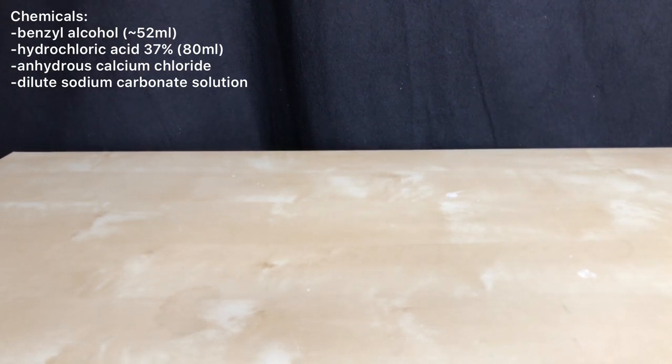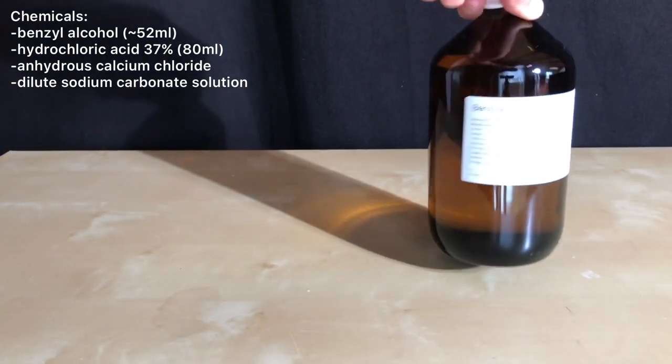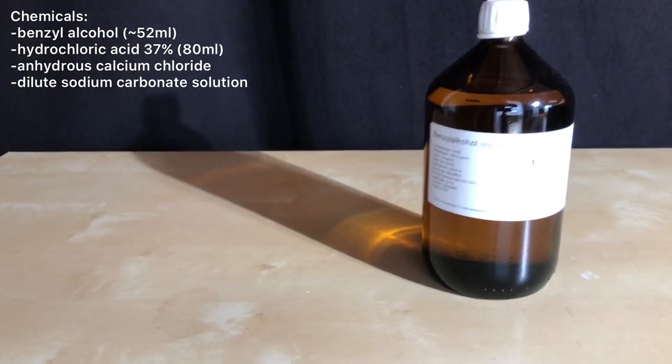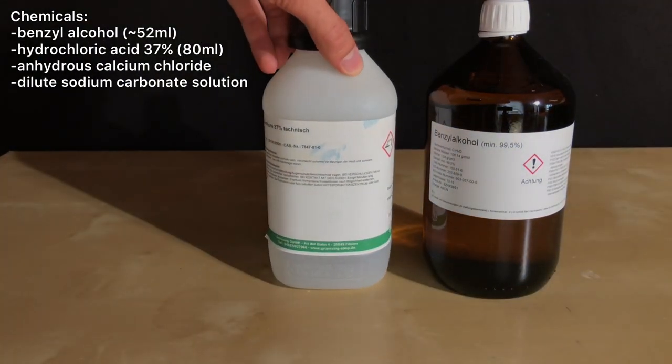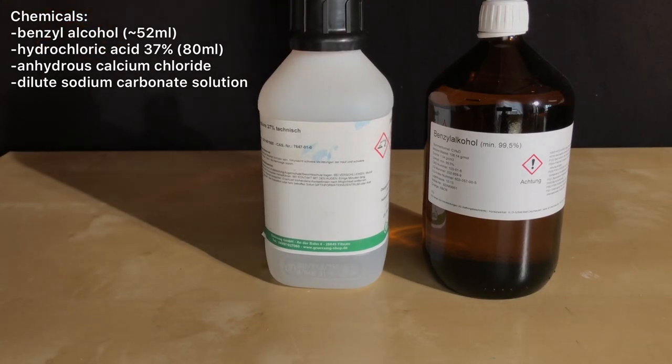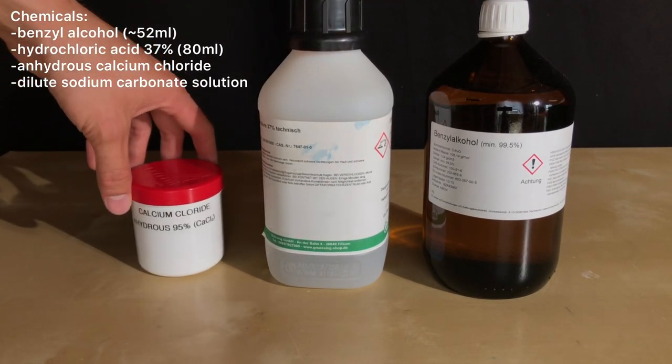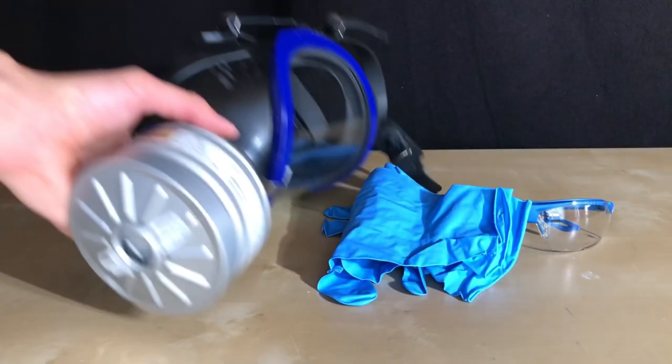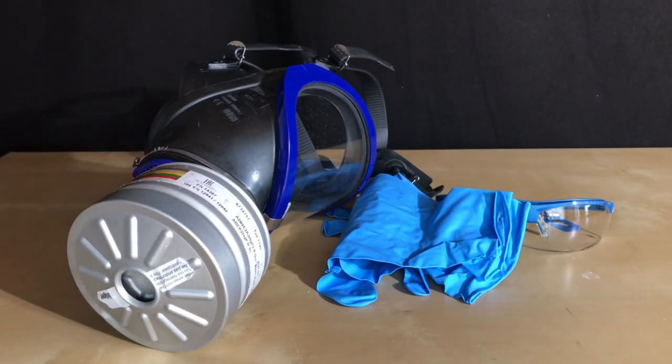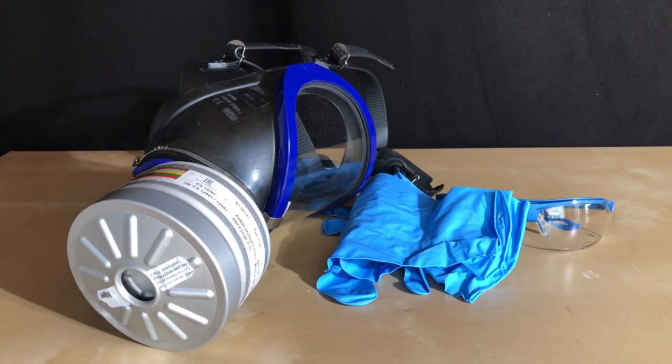The chemicals needed for today's preparation are around 52 ml of Benzyl Alcohol, 80 ml of 37% hydrochloric acid, which represents a huge excess in hydrochloric acid, and Sodium Carbonate Solution. Benzyl Chloride is toxic and a potent lacrimator. Therefore a gas mask and nitrile gloves will be worn. The preparation will even be conducted in a very well ventilated area.